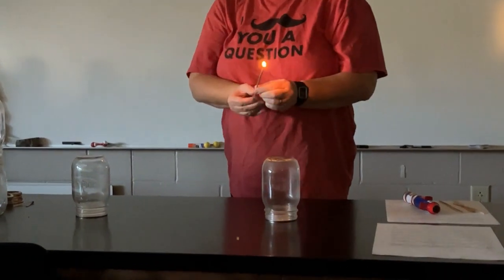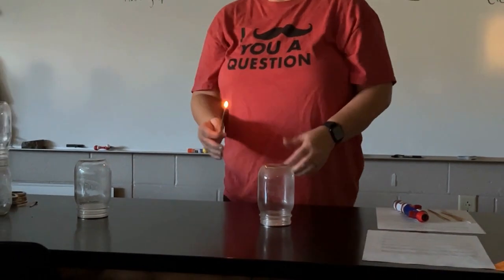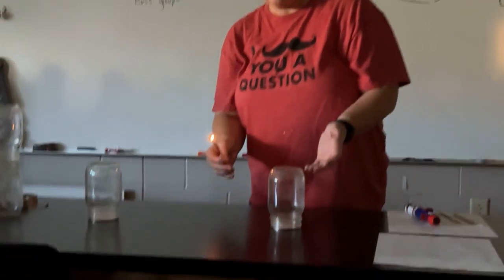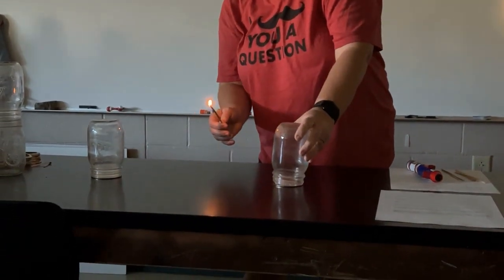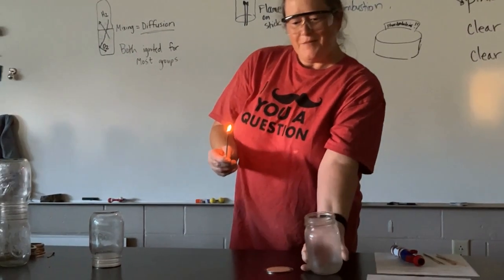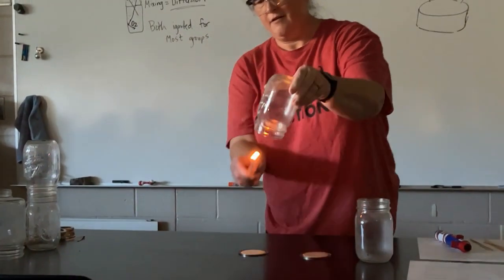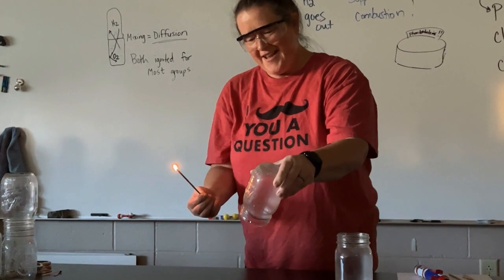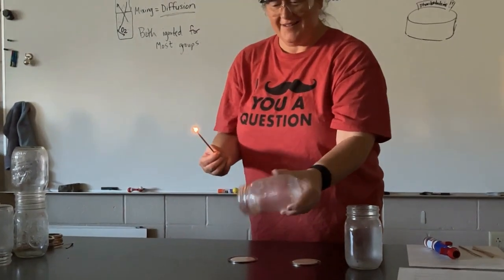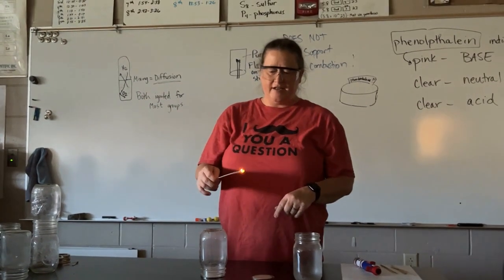And in experiment 4, bottle 4, this was done with air. However, in this demonstration, I did it with pure oxygen. So a little bit more explosive, not as gentle of a burn. And a little more explosive as well, not as gentle of a burn, but definitely hydrogen and oxygen in each of them.